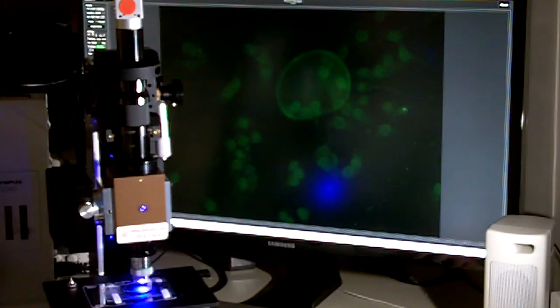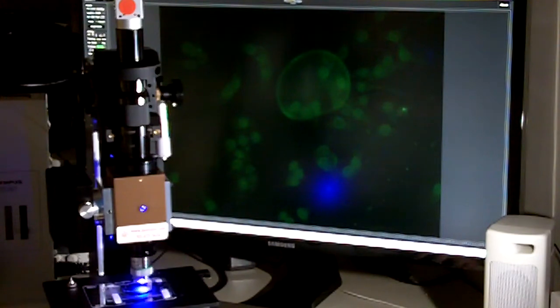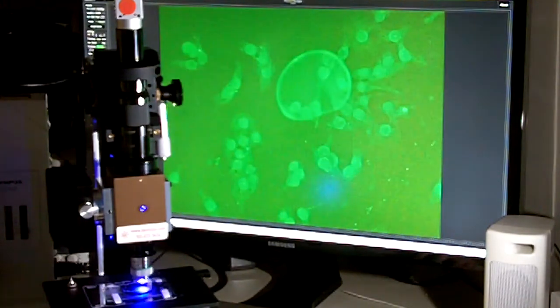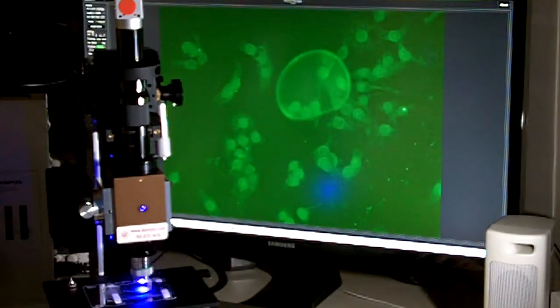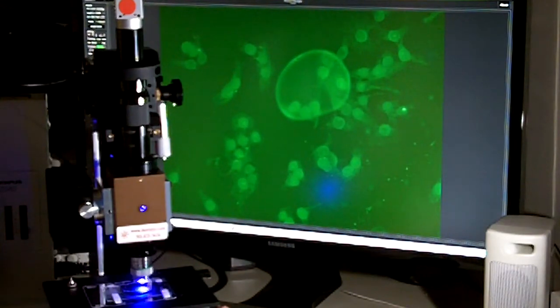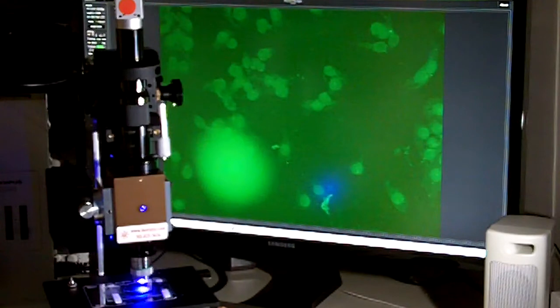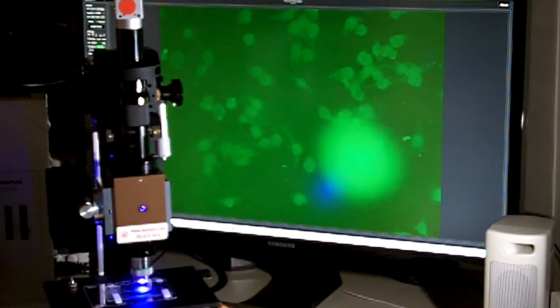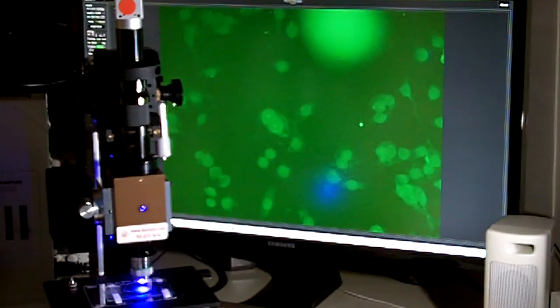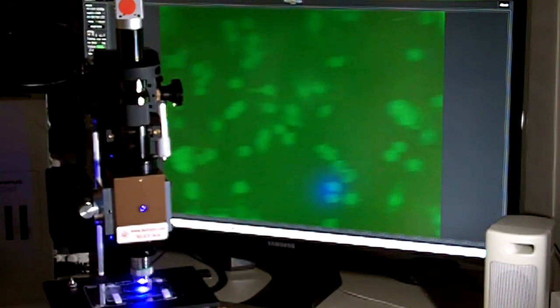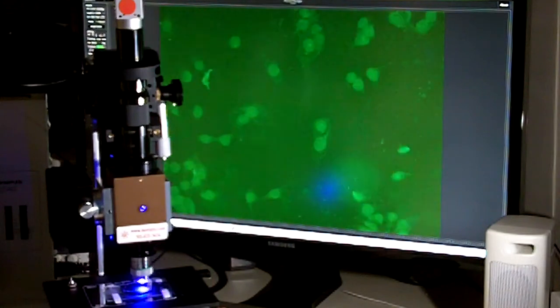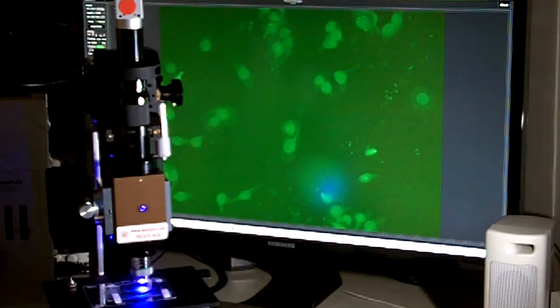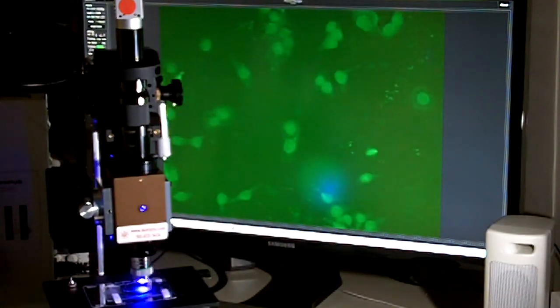So there's all kinds of combinations here. Let's tweak up the gain a little bit so you can at least see what's going on here. We have a mechanical stage that allows us to move the sample in the X and the Y axis. So you can see that's not bad for a 20-some year old slide.